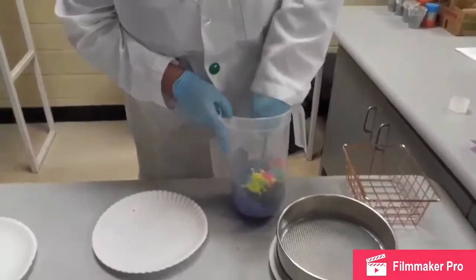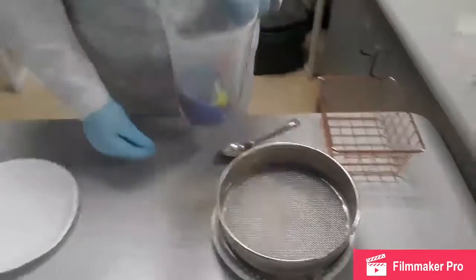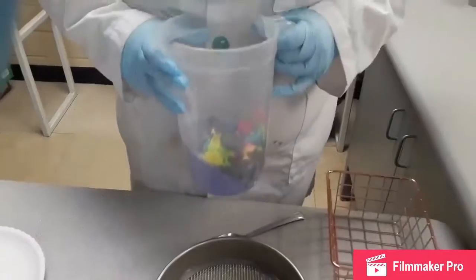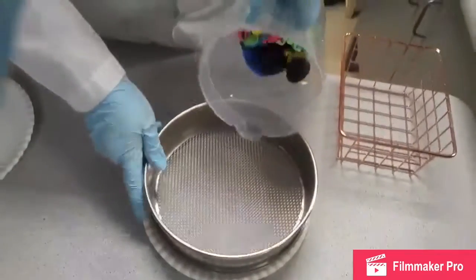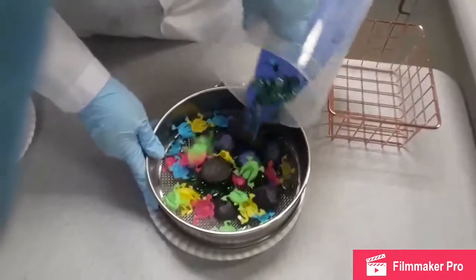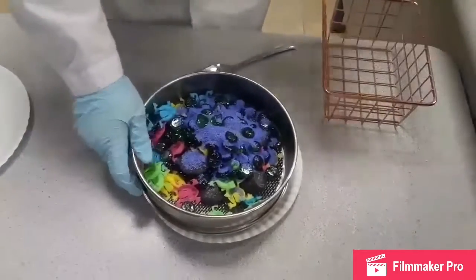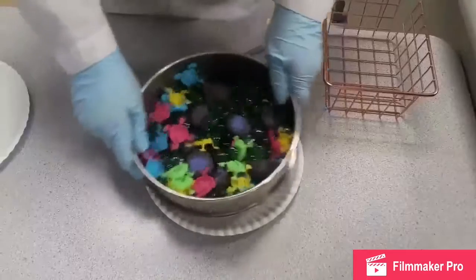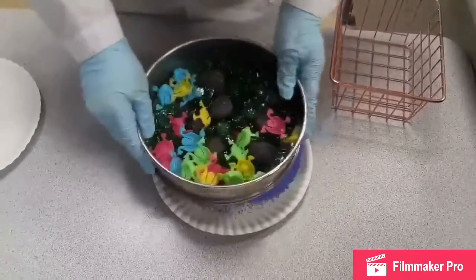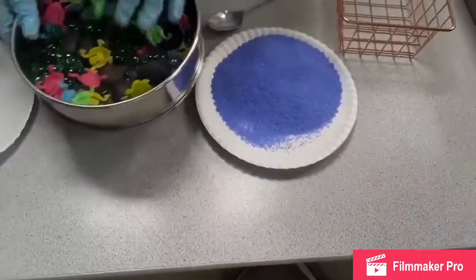We will move the mixture over to the sieve and pour it in to separate out all the blue sand particles. Now you can see that all the sand has been separated from the rest of the mixture.